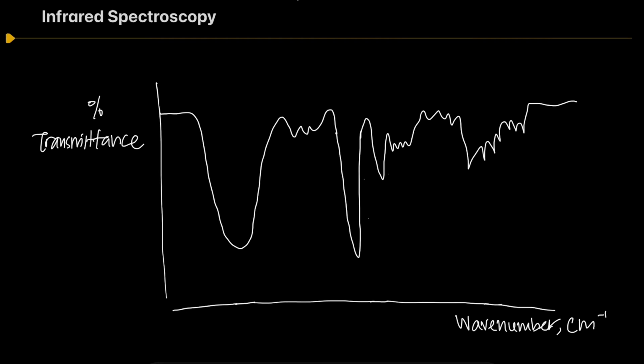Hi everyone, so we'll continue with infrared spectroscopy. In this video I'm going to share with you the factors that affect the position of the absorption band on the IR spectrum, and also the factors that affect the intensity of the absorption band.